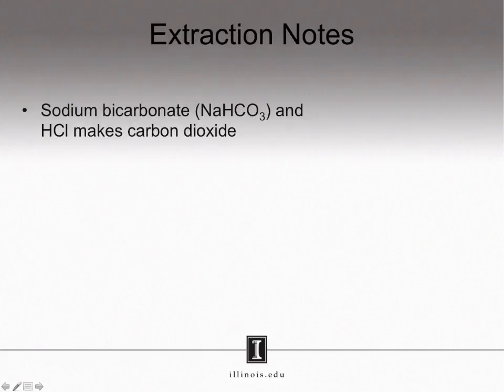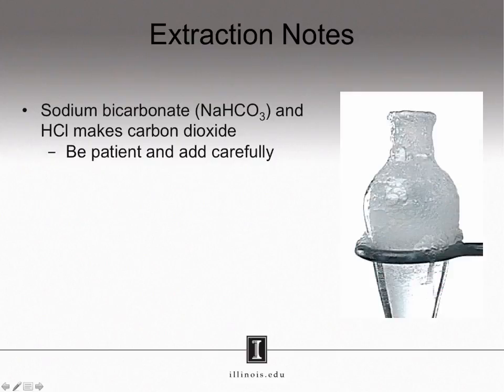A quick note on extraction before we continue. Sodium bicarbonate, being a base, will react with hydrochloric acid. In this process, you will make carbon dioxide, which is a gas. It is very important that you are patient and add your sodium bicarbonate solution carefully. Otherwise, you may make a little volcano in your hood, producing a mess that you will have to clean up, like you see here on the right.